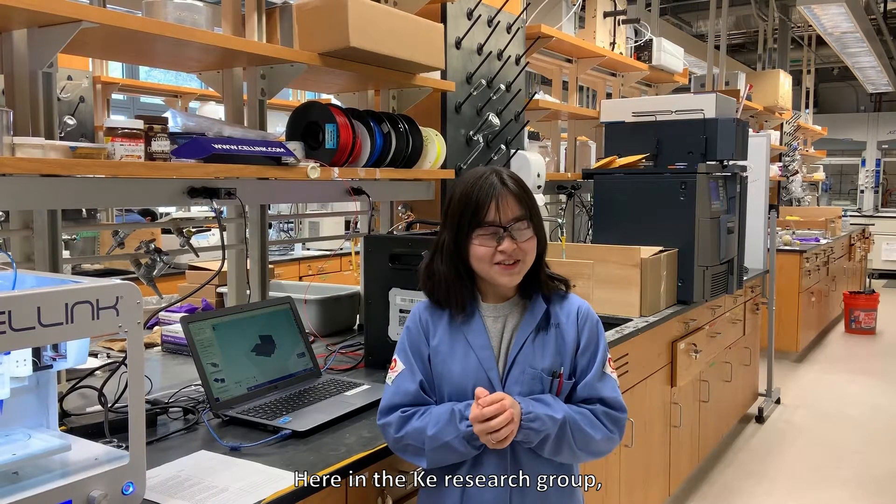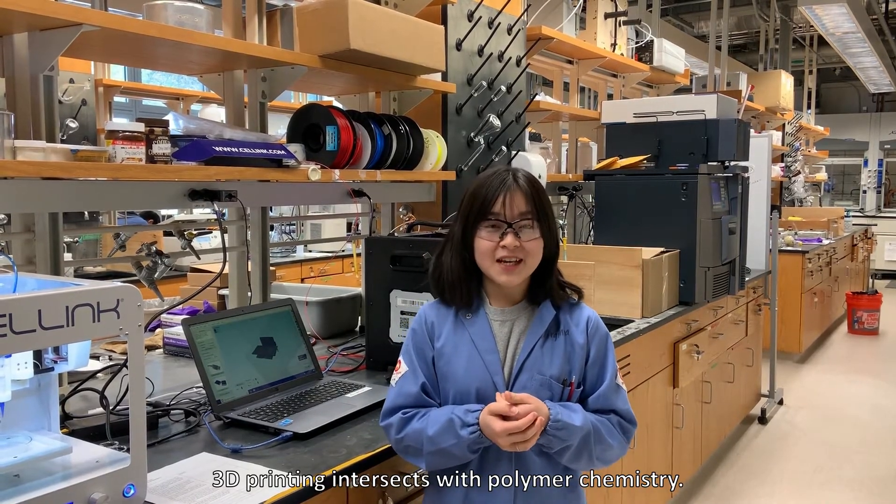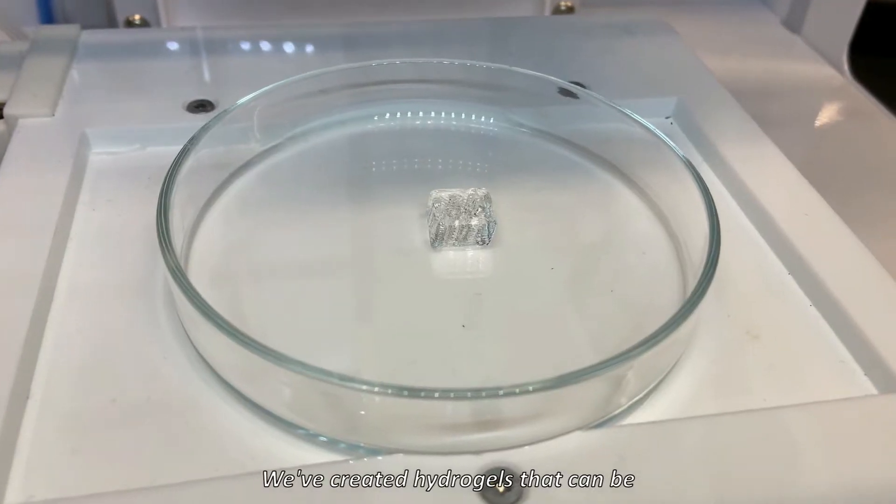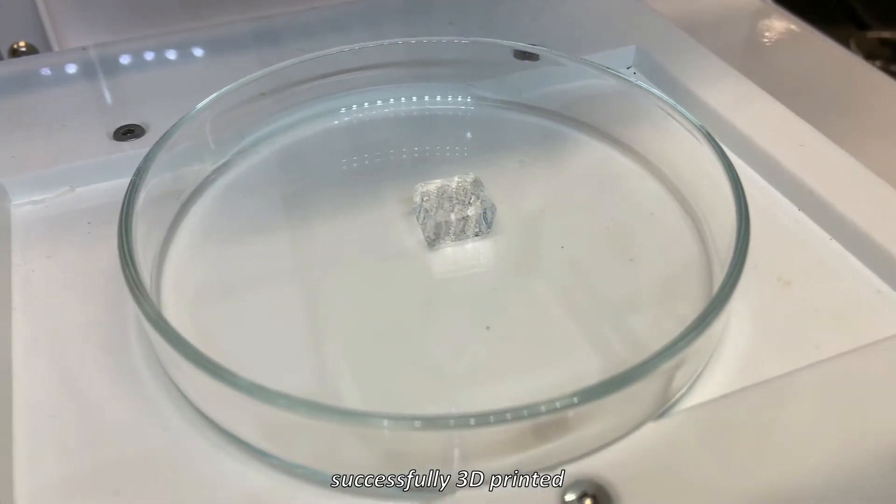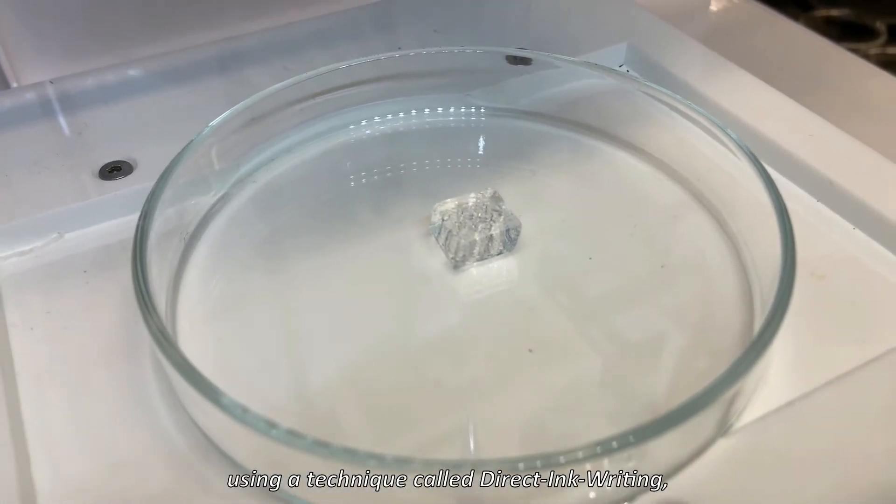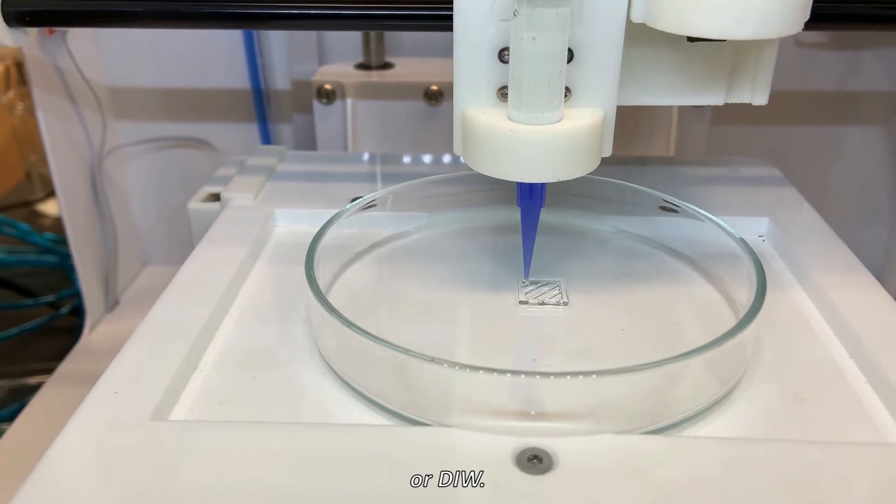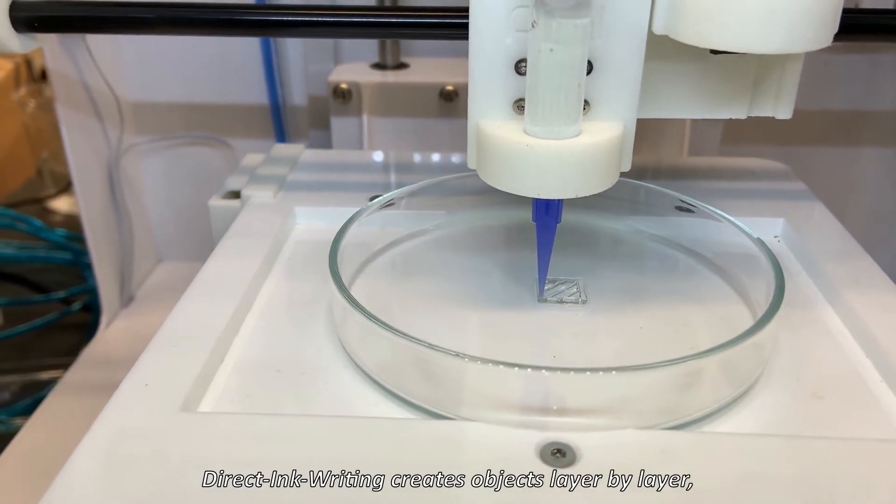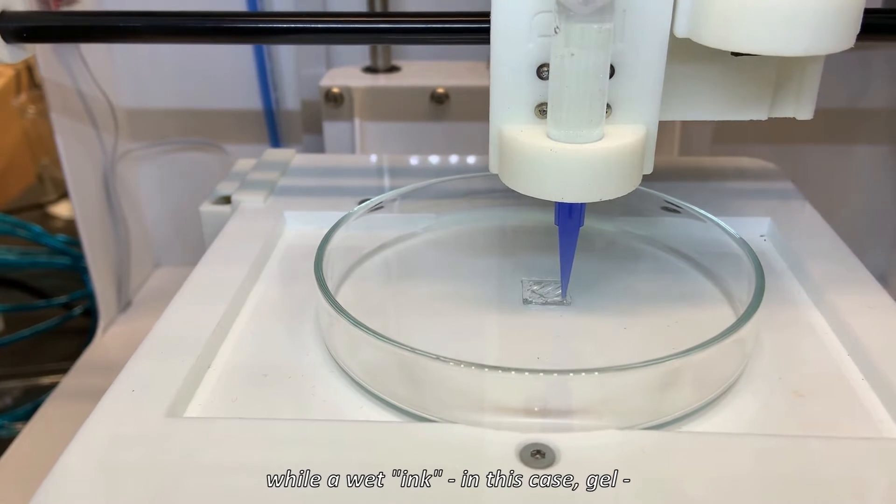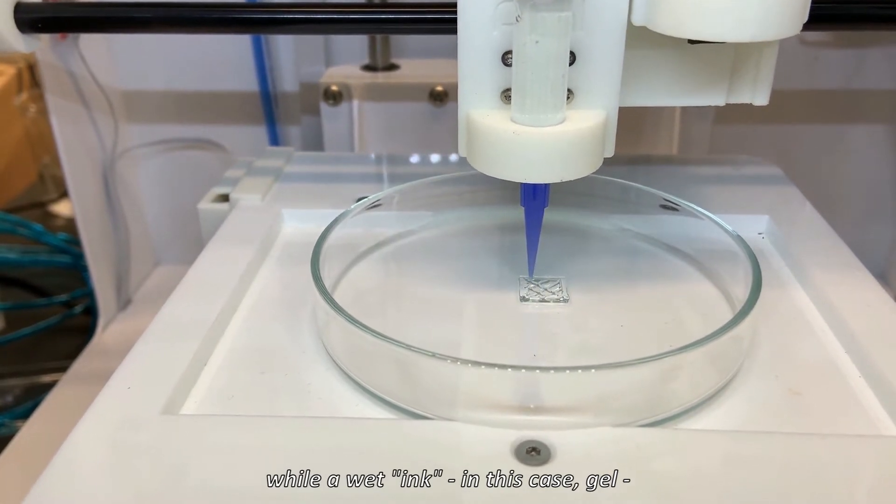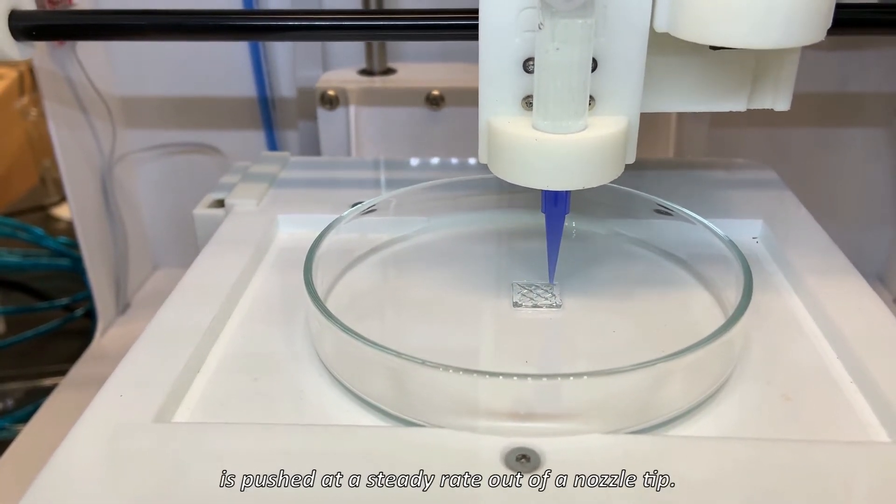Here in the Ke research group, 3D printing intersects with polymer chemistry. We've created hydrogels that can be successfully 3D printed using a technique called direct ink writing, or DIW. Direct ink writing creates objects layer by layer, while a wet ink, in this case gel, is pushed at a steady rate out of a nozzle tip.